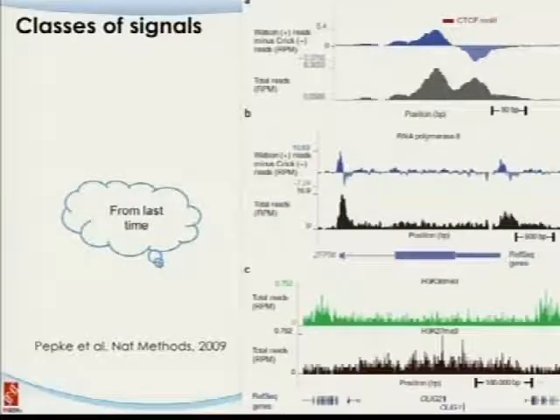But for the second part, there's RNA polymerase II. So you can see there's a gene expression. This is a transcription starting site. And around the promoter region, you will see this nice peak. And then after that, there will be transcript regions, and you can still see reasonable enrichment. And then by the end, the Pol-II pausing and eventually getting off from there. And for the third part, which is epigenetic markers, you can see this is a longer range. There could be several thousand base pairs, and you see gradually enriched signals along there.